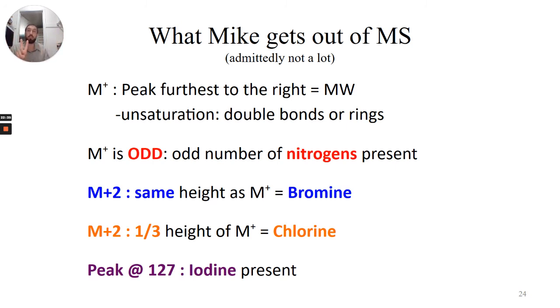What's special about those 2 isotopes is they show up in roughly half of your samples. So if I look at bromine, half of it is isotope 79, the other half is isotope 81. So when I look at a random collection of pieces, I would expect to see an equal percentage of bromine 79 and bromine 81 in that sample. That's why we're seeing those 2 peaks next to each other.